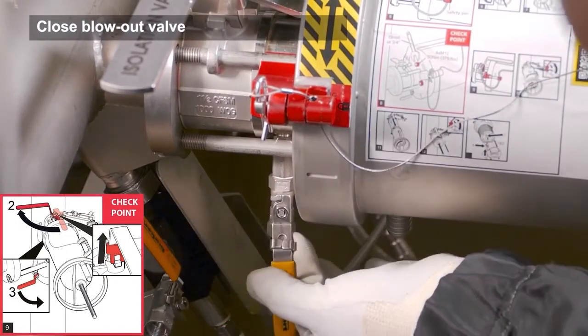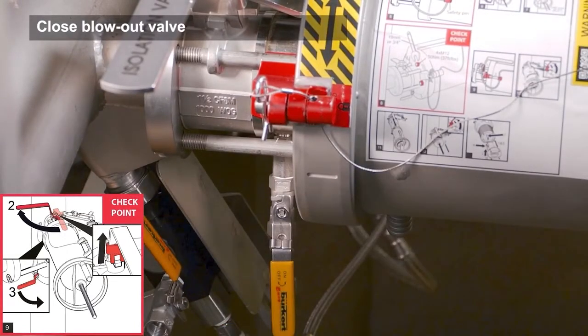Open the blowout valve under the isolation valve for box cleaning to get rid of any process liquid inside the isolation valve. Be aware of splashing as some process liquid will leak out through the blowout valve.